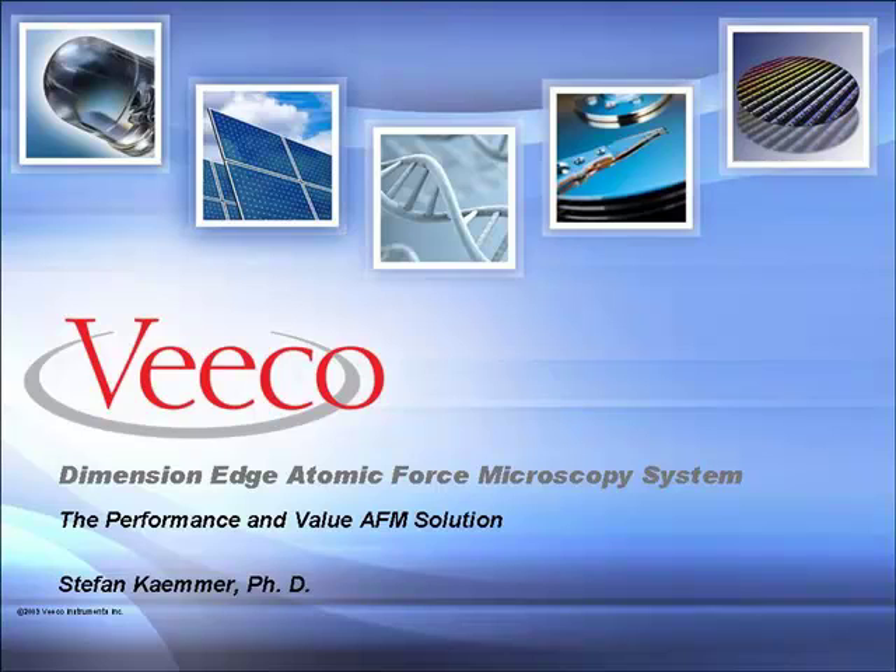Hi, my name is Stefan Kemmer with VIKO Instruments. In this short video I would like to give you an overview of the Dimension Edge Atomic Force Microscope System.